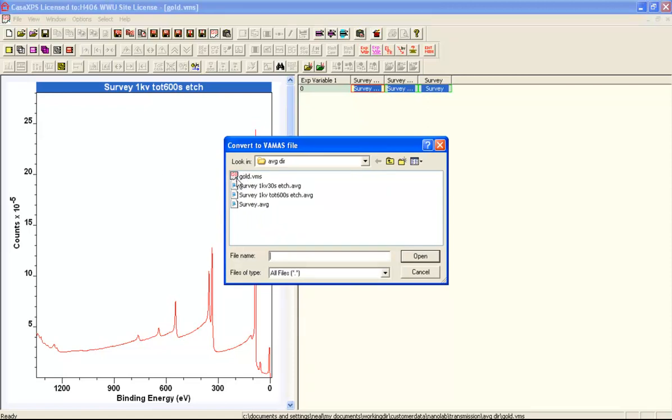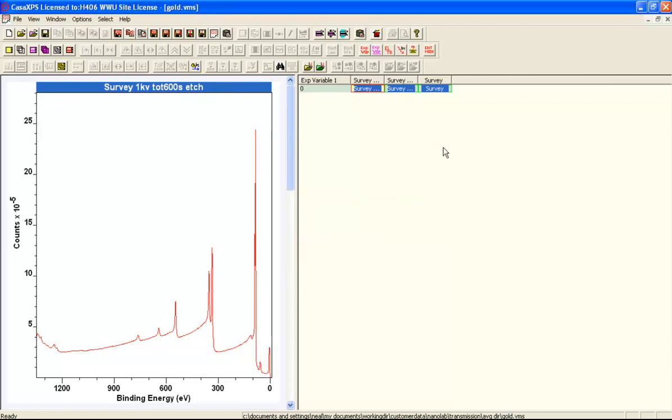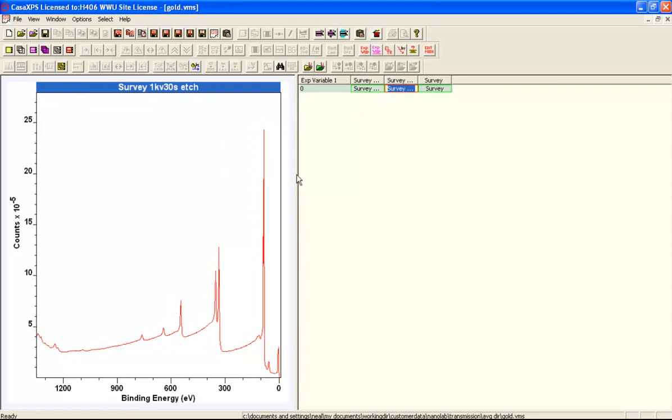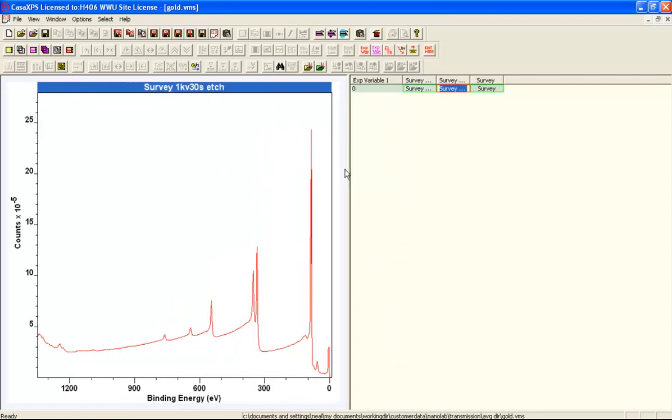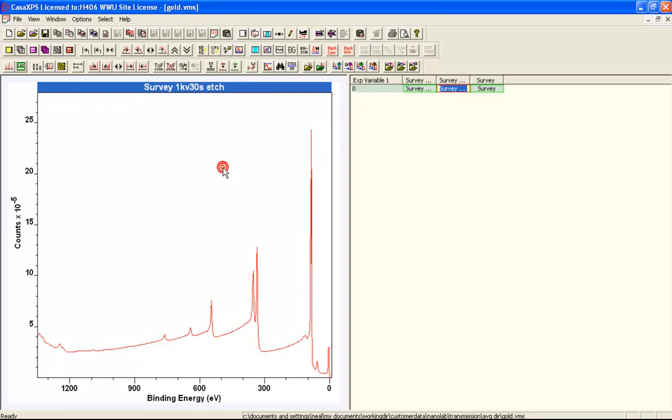You can see the VAMAS file name is GOLD.VMS and these are the original AVG files. We'll use these to have a look at quantification of a survey spectrum and various implications of escape depth and other corrections for these types of data.